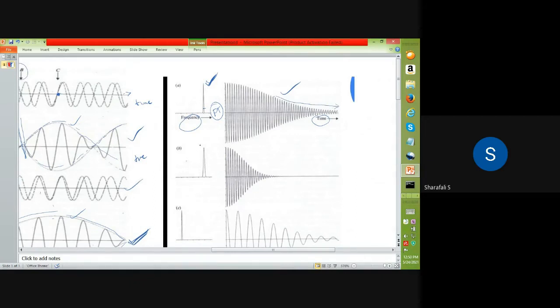When the breadth of the signal is larger, as you can see here compared to this one, meaning the full width at half maxima is larger for this spectra, and you convert it from frequency to time domain using the Fourier transform, the decaying effect will be larger in that case.